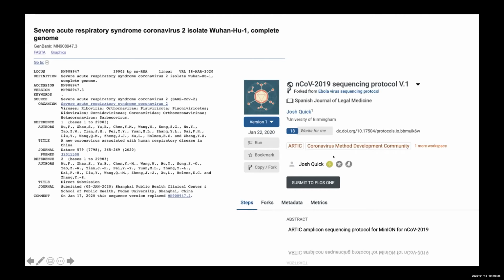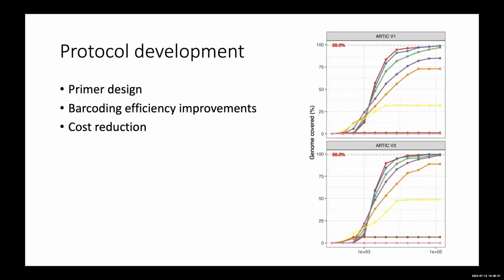and that's both the primer scheme itself and the accompanying lab protocol to work with it. Over the months, we released some changes to the primers. I wish I'd used minor versioning now, because we were already up to version 4.1, or we're already up to version 4. But we changed the primers over time to work with the emergence of new variants.